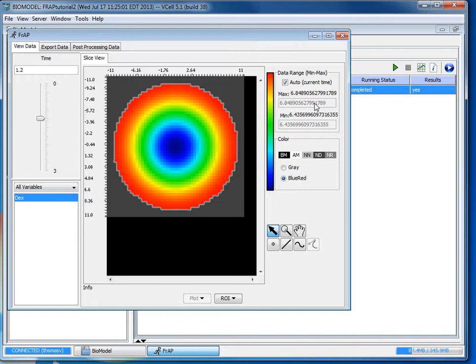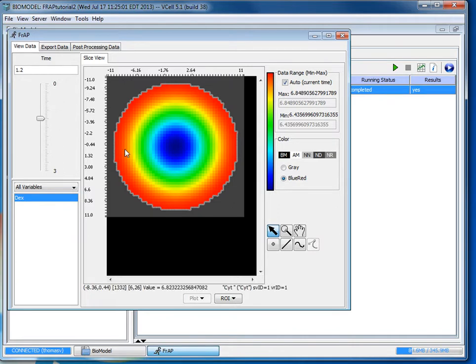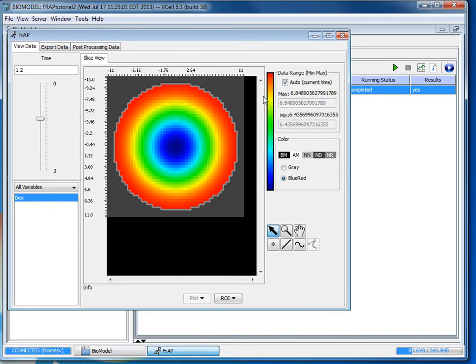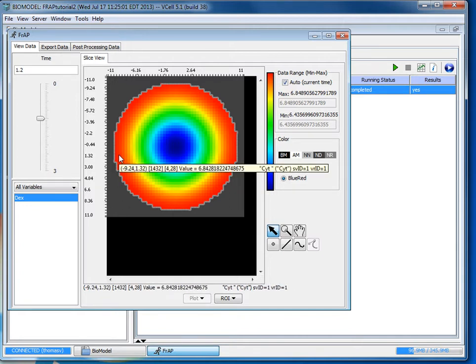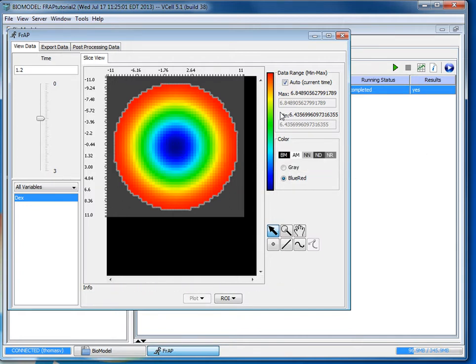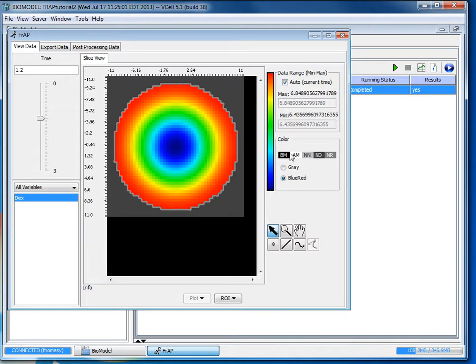While you're looking at the simulation results it's important to notice what the maximum and minimum values are because sometimes they might not start differing until the millionths or a very negligible amount of difference. But V cell will still display it as this color scheme so it might look like it changed a lot but it hasn't. So it's always important to check the maximum and minimum values here to ensure just how much it is changing.